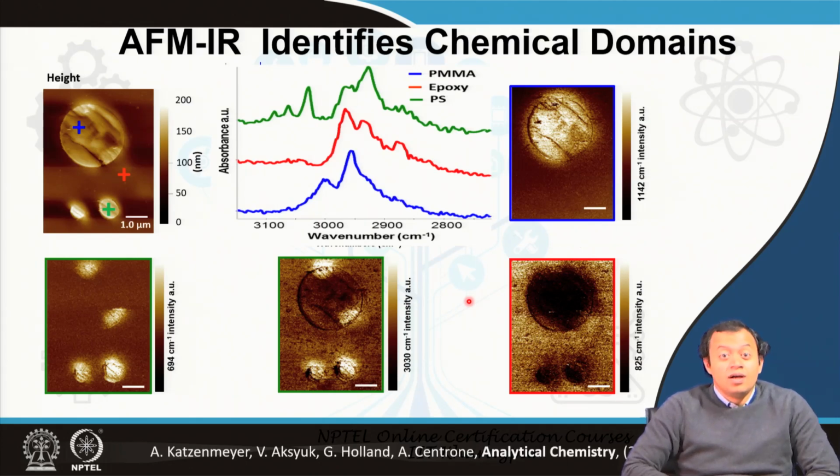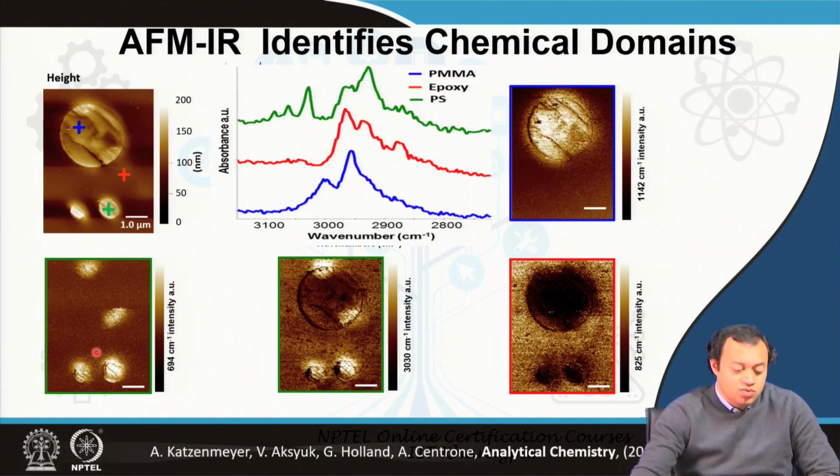Now tell me this, can you utilize them from a known sample to an unknown sample? Can you therefore take lung tissue, image it and try to identify where the coronavirus is located? Because the coronavirus will be around 100 to 200 nanometer, that is the size. We are seeing comparable sizes.